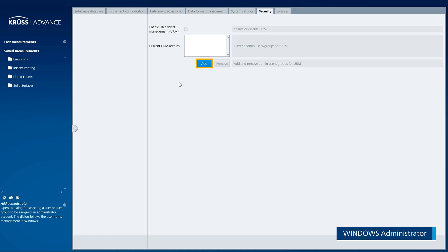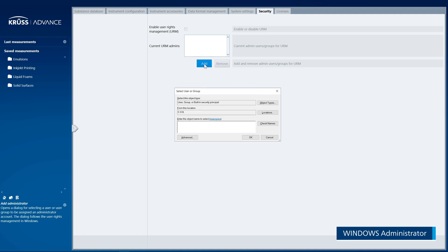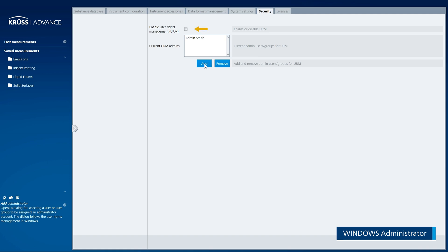Click Add to add a user or a user group. A Windows dialog box will open. Advanced User Rights Management is based on Windows User Account Management. Enter the user who is intended to be the first administrator. Enable User Rights Management.